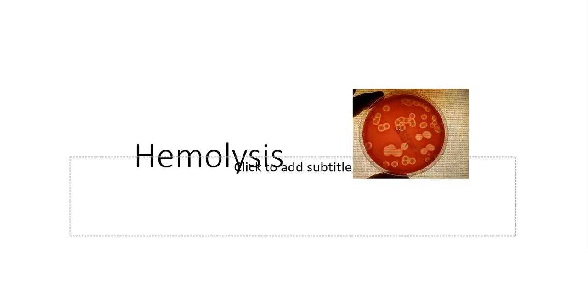Okay, the last lab we looked at staph, or we've looked at some of these things. I want you to also look at strep. So I've got two labs, differentiation of staph and differentiation of strep, and I decided to put strep together with respiratory because of all the strep infections, so just FYI.